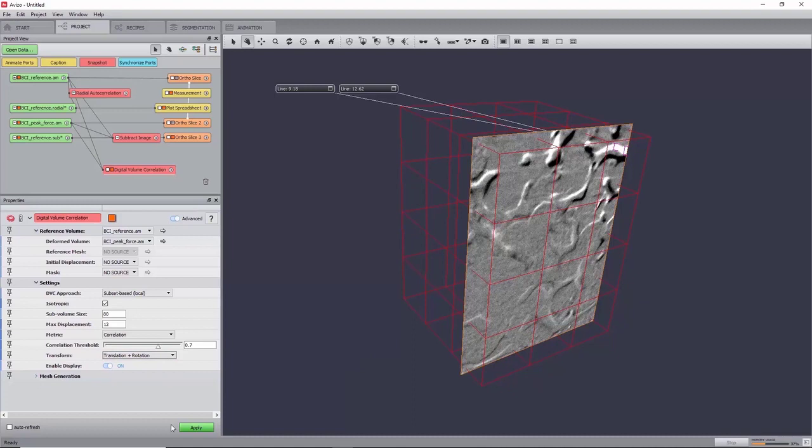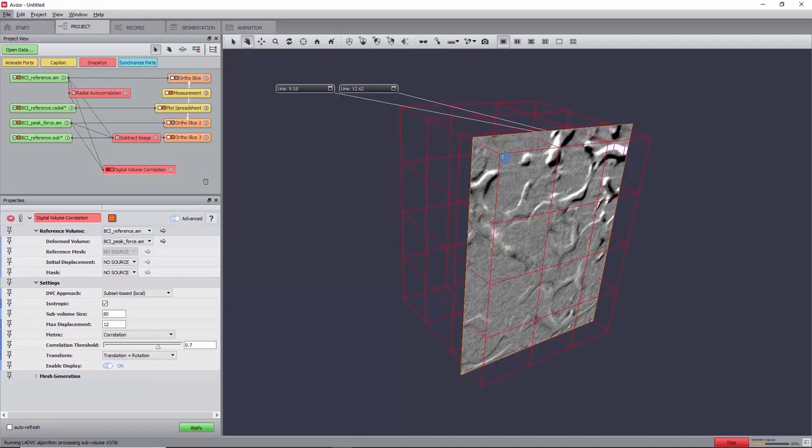The algorithm will find iteratively the best six parameters of a rigid transformation matrix that produces the best match between grayscale intensities in the reference and deformed image. A metric of 0 will mean no match, and a metric of 1 a perfect match.